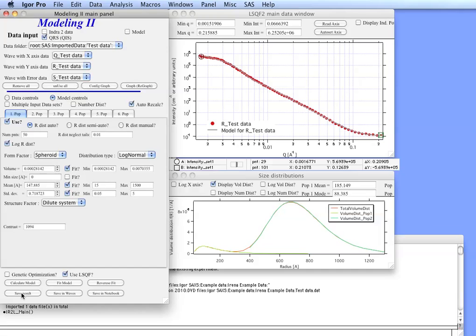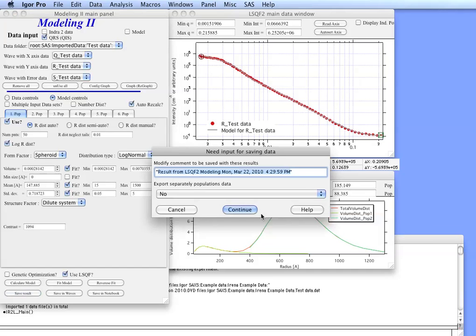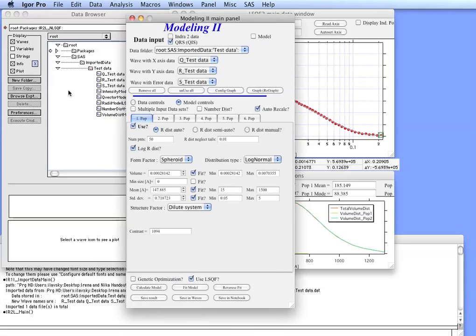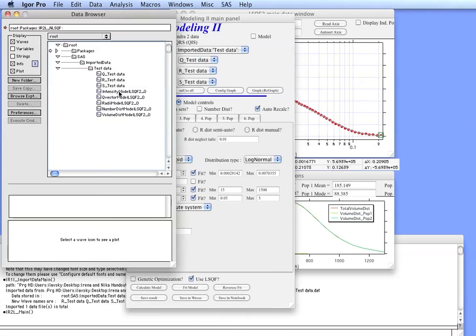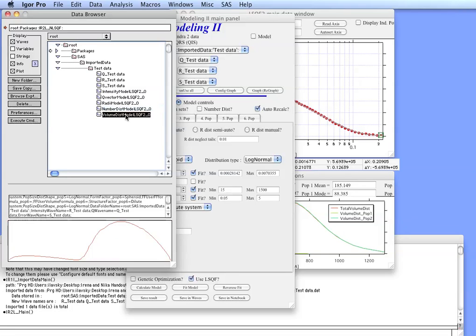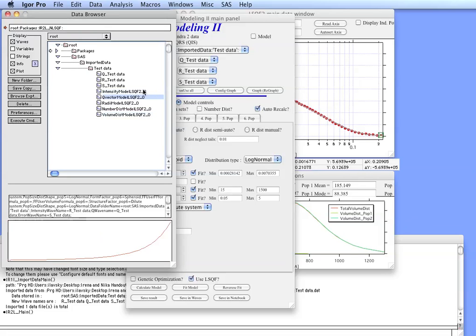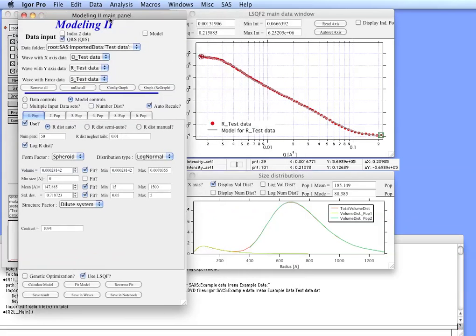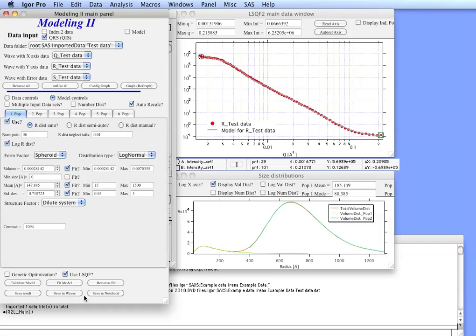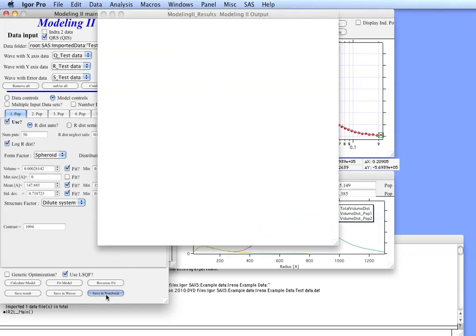So with this now what you can do is you can save results in a folder. You do that inside the folder where the data where you now have created radii distribution. You get the number distribution and you get the volume distribution of the particles. You also get the intensity and Q for the model itself. You can also save it in waves, which I suggest you read in the manual what it is. And you can save in a notebook.